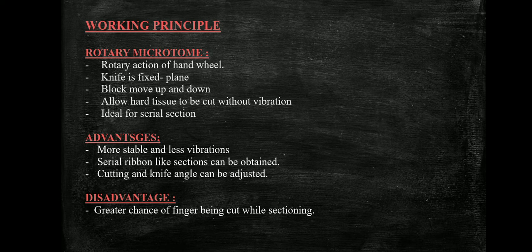Then advantages: more stable and less vibrations. Serial ribbon-like sections can be obtained. Cutting and knife angle can be adjusted. Disadvantages: greater chance of finger being cut while sectioning.